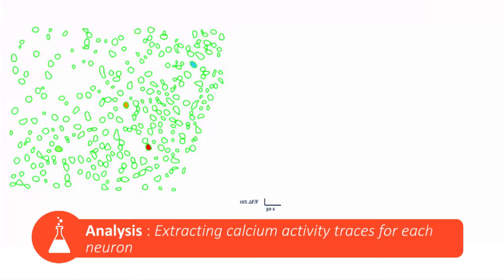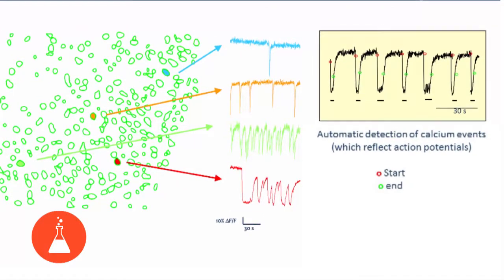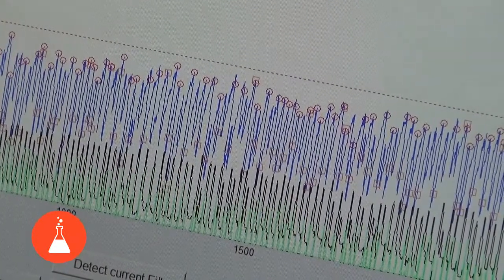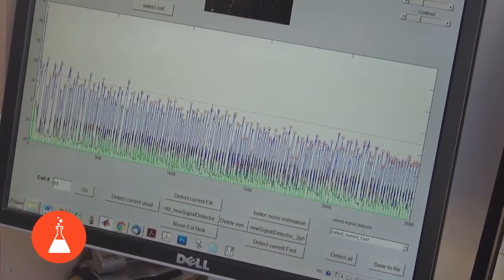This program enables us to trace the shape of each of the neurons. The shapes of the neurons are associated with their natural variation in calcium fluorescence over time. The software enables us to analyze in detail each variation of every neuron over time. In fact, the program automatically places small, round markers at the start and small, square markers at the end of each calcium fluorescence event or variation. The program marks these calcium events for all the fluorescent neurons in recordings whose shapes have been traced.